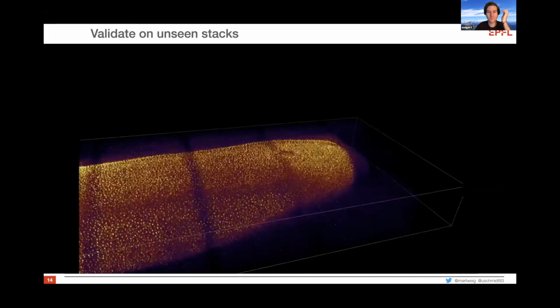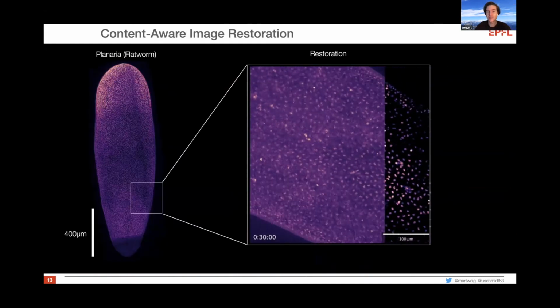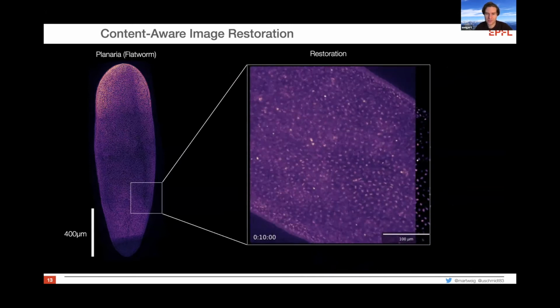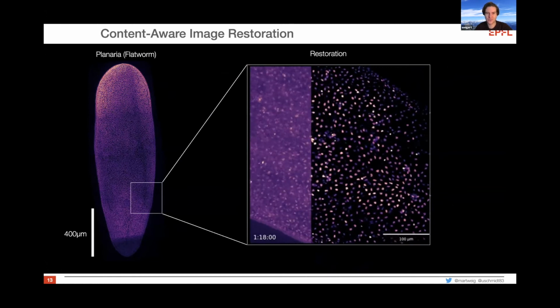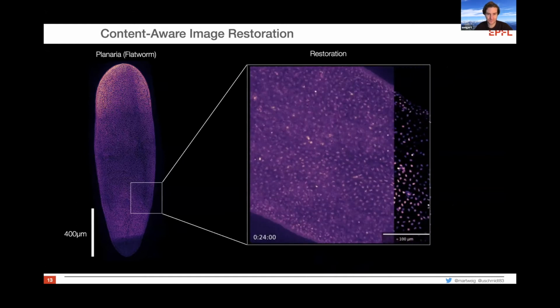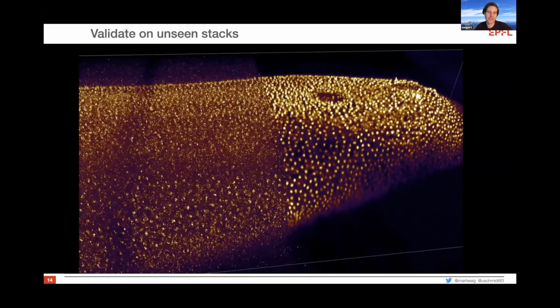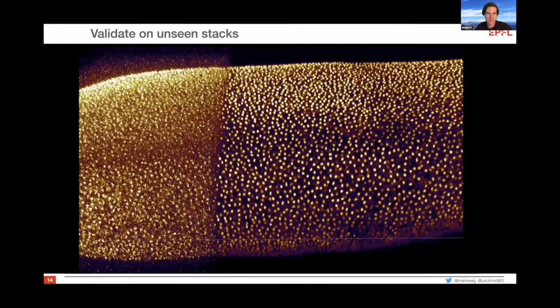And if you do that, you can then apply it to live cell imaging of new worms and denoise them quite satisfactorily. So you can then make out individual cells, and all this noisy background that typically hampers any normal thresholding is just gone. This, of course, works in 3D, so you can get rid of most of the clutter in this case, a tiled volumetric acquisition of the worm.